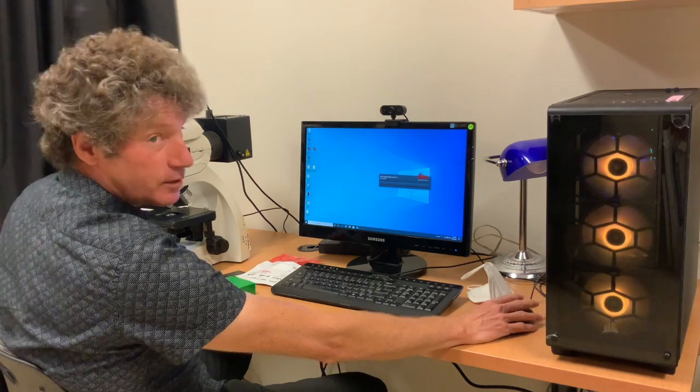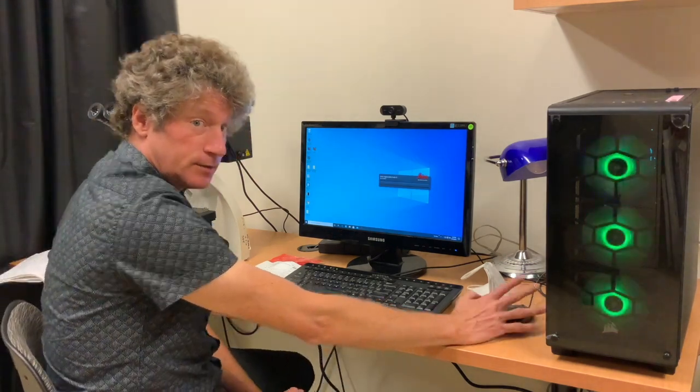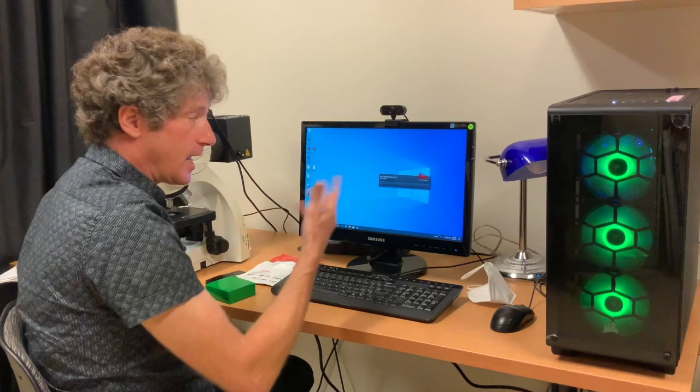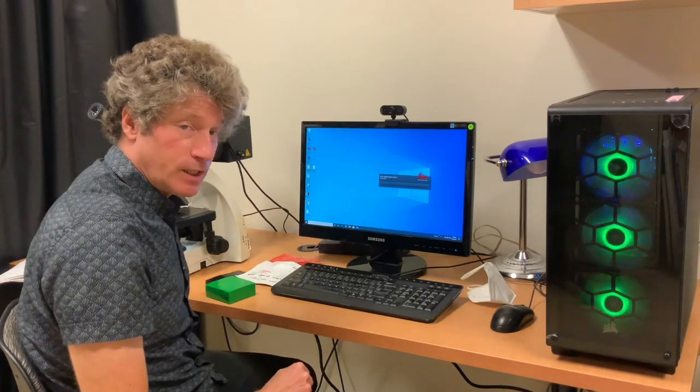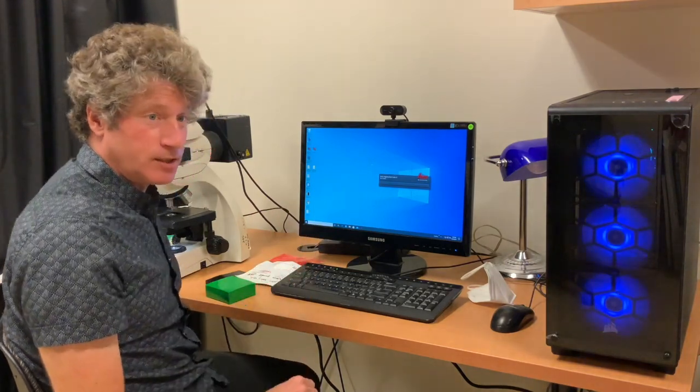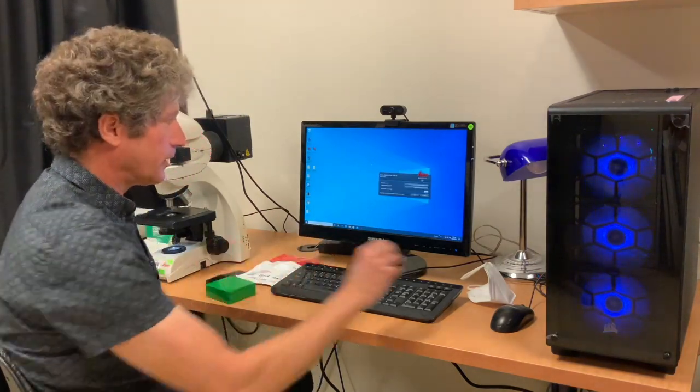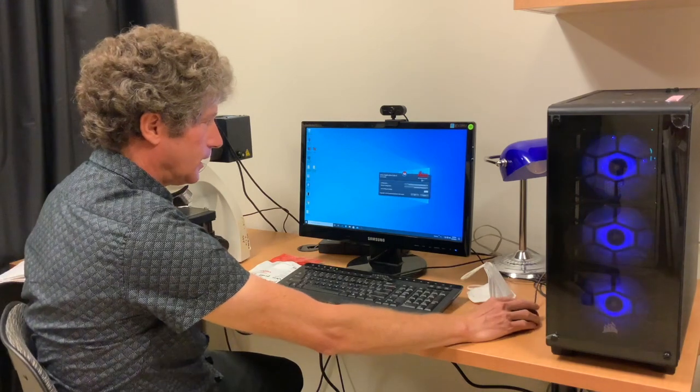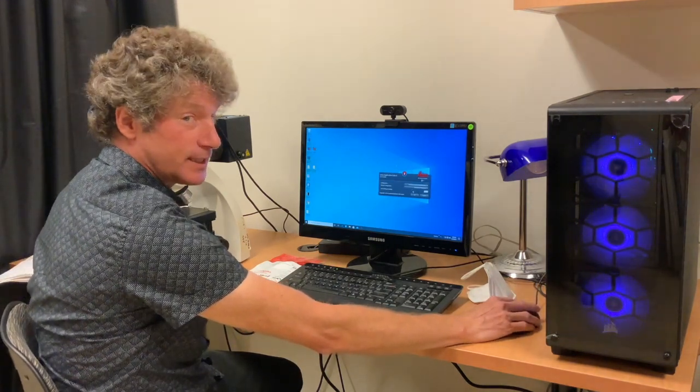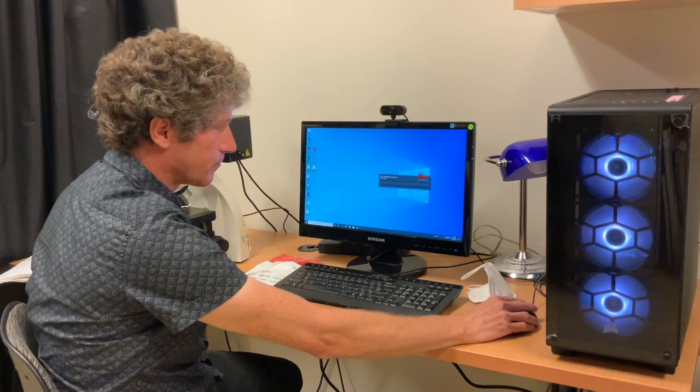It might take a little bit to get going. You just start it up and hit okay. If it gives you a menu prompt asking what hardware setting you want, keep the one and go ahead. Like here, it says it's going to go anyway if you don't do anything in 10 seconds, but I hit okay.